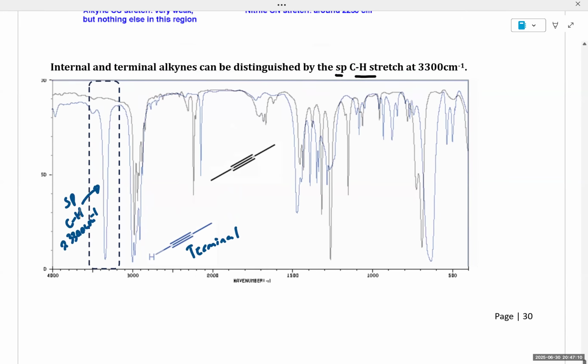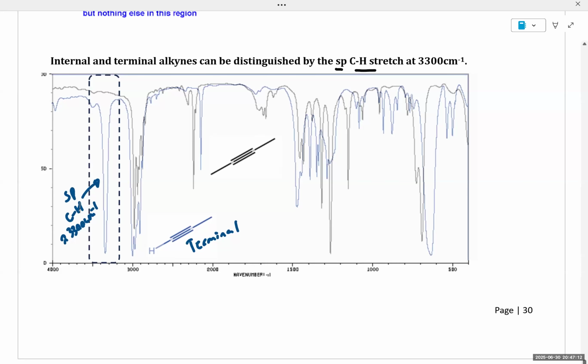Okay, so that concludes our discussion of infrared spectroscopy. It's a really powerful tool for identifying functional groups, and it's a complementary tool to mass spectrometry and to the next structural method that we'll be discussing in the next chapter lecture, which is NMR spectroscopy. So with that, this concludes our Chapter 10 lecture. The next lecture series will focus on Chapter 11, which discusses NMR spectroscopy.